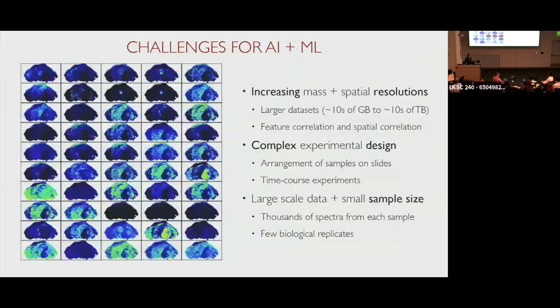And so the challenges for mass spectrometry imaging are that we have potentially hundreds of thousands of these different images because we can have potentially hundreds or thousands of molecules in our samples. Here I just have a selection of a subset of some of the ion images from that single pig fetus section, representing many of the different molecules here. So from a machine learning and kind of AI perspective, and my background is as a computational scientist, as a statistician, that's where I'm coming from.